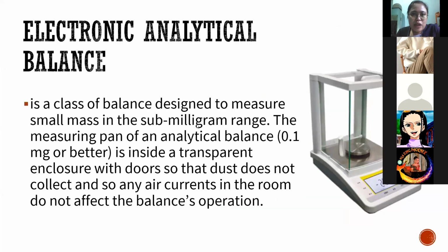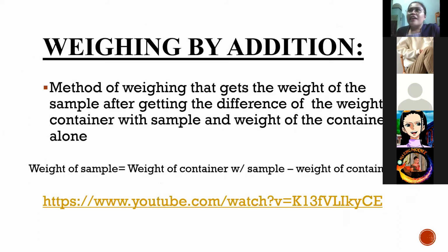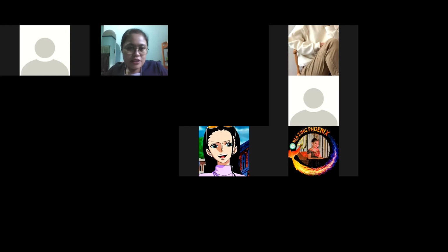Okay? So, naa tay techniques in weighing and akong problema, wala siya ginagamit, ginahimo sa mga estudyante. Bisag unsa na lang ang ginahimo, wala na technique sa weighing. Pero sa QC class, when we do analysis, we really have to follow the steps sa mga techniques nato. We only have two, weighing by addition and weighing by difference. Now, let's look at how are we going to do the weighing by addition.